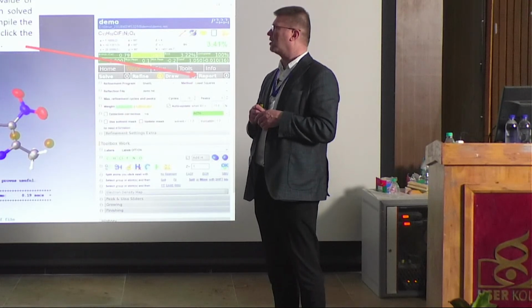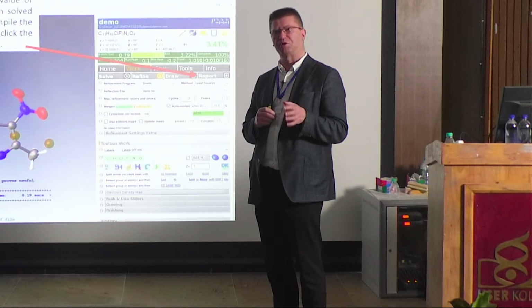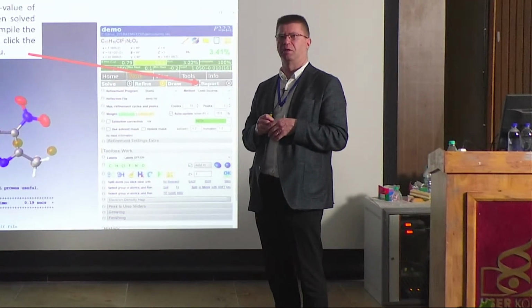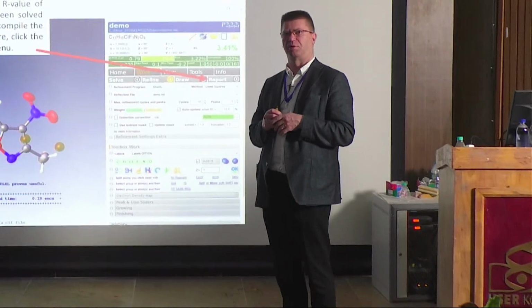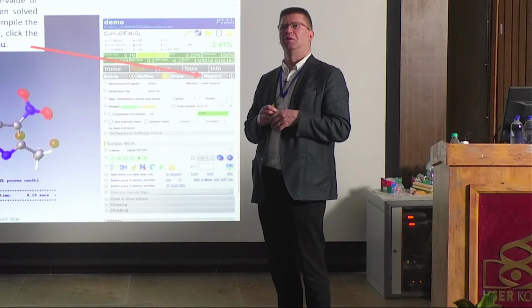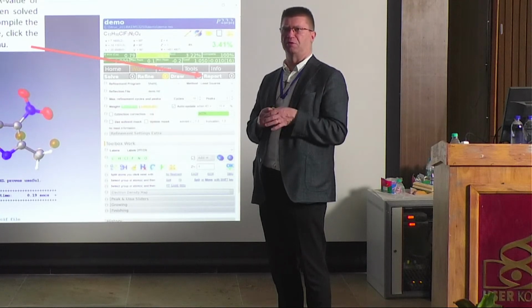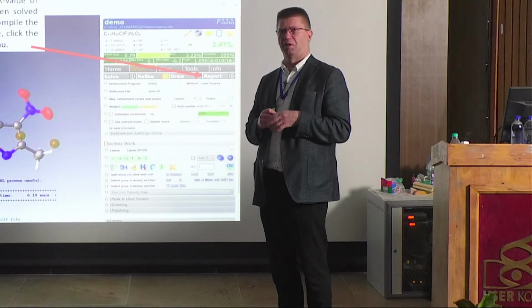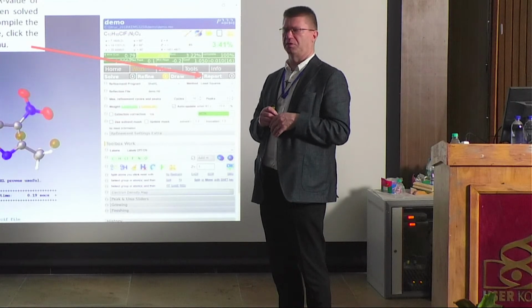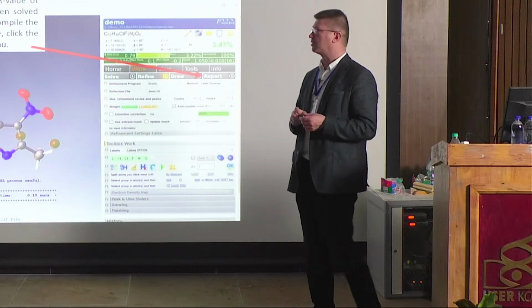So this is lecture 9, and then in lecture 10 I will show you which kind of supramolecular structures we have been doing in the past 30, 40 years. Lecture 10 will be more like a scientific discussion and a scientific talk, but not focusing on one topic like I did yesterday afternoon, but giving snapshots of different kinds of things that can be done with X-ray. Some of them are really old ones. But let's go now into this analysis part.